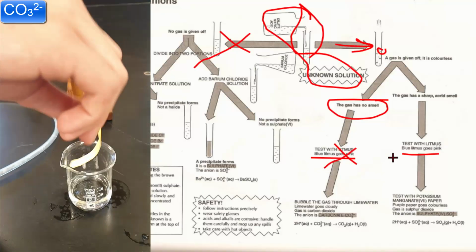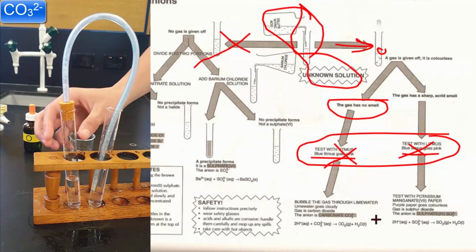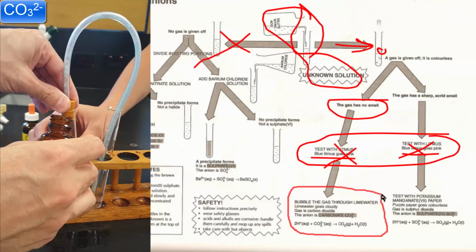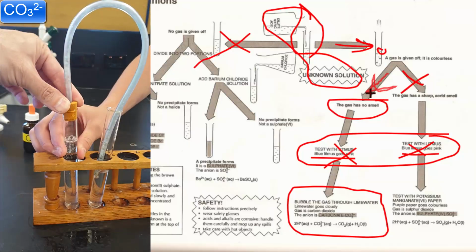Sorry about that one. It seems a bit pointless anyway because both lines have it. And finally, we don't really get enough carbon dioxide gas to make the lime water go milky. So that is not highly successful, unfortunately, but it doesn't have a smell to it. And so we're just going down this line.